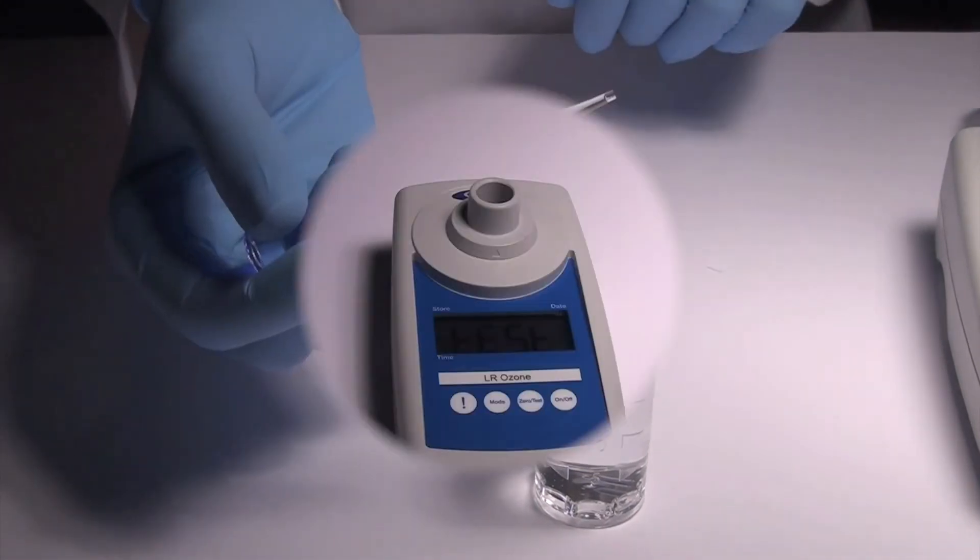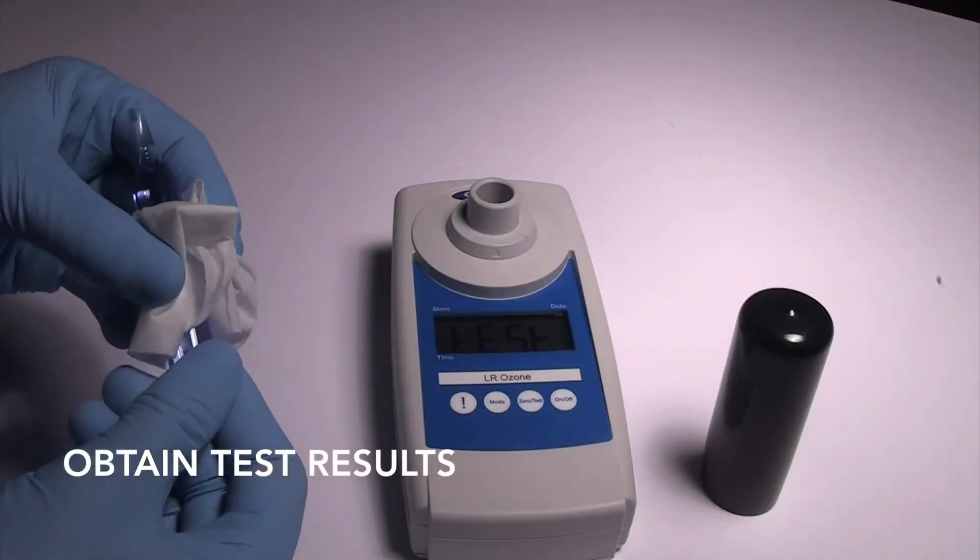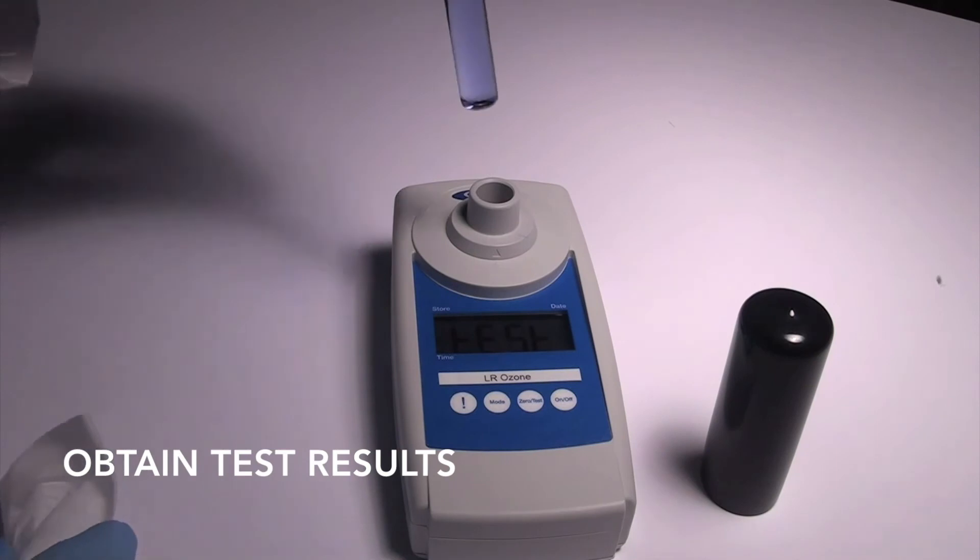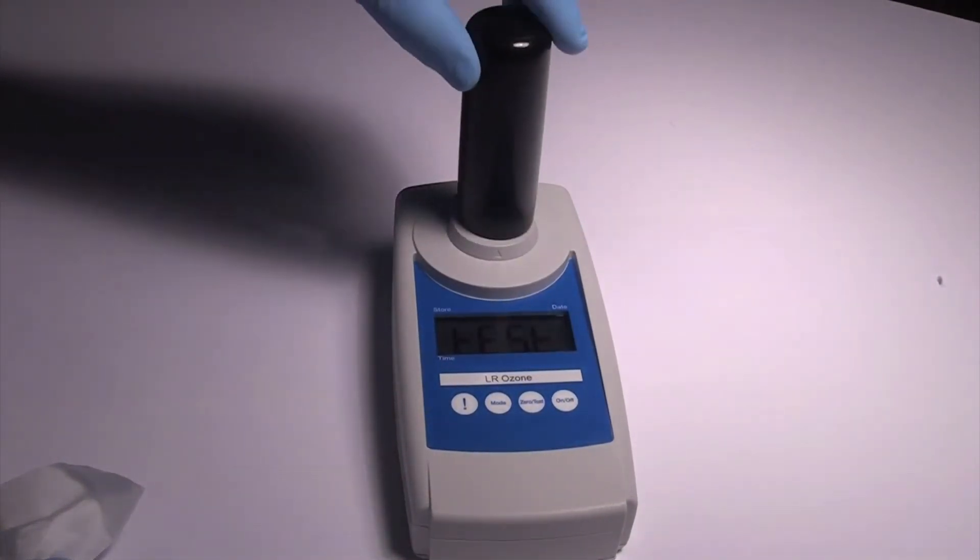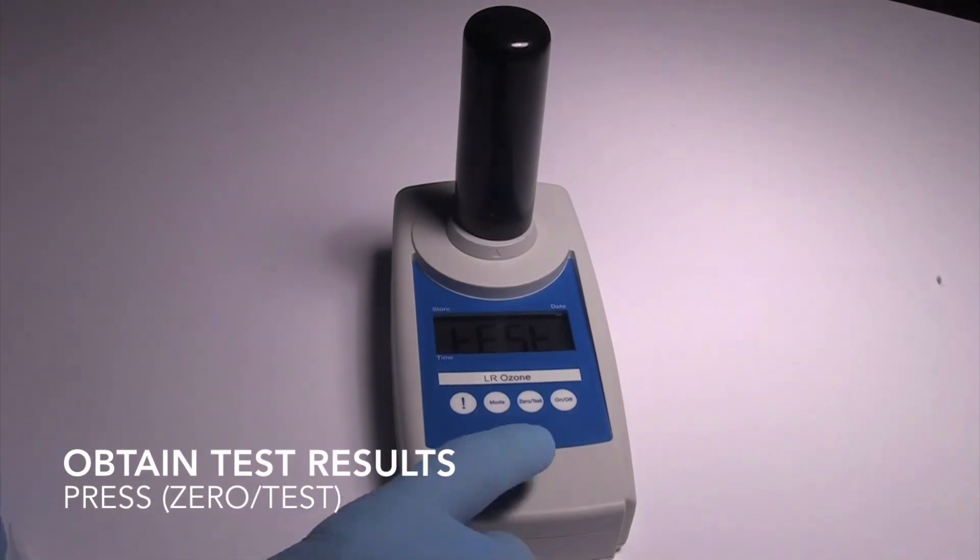Dry the ampoule and insert it into the photometer, flat end first. Place the light shield over the ampoule and press zero test. The SAM photometer will display a test result in parts per million ozone.